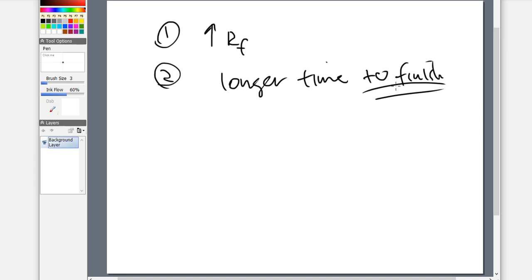We've actually seen this take place most of the time in our own situations as far as working with these lab experiments are concerned. So this is nothing extraordinary. This is nothing that's unexpected. We actually have seen this in person. So in the beginning, it goes faster, and then as it travels up the plate, it begins to slow down a little bit longer, a little bit longer, and a little bit longer.